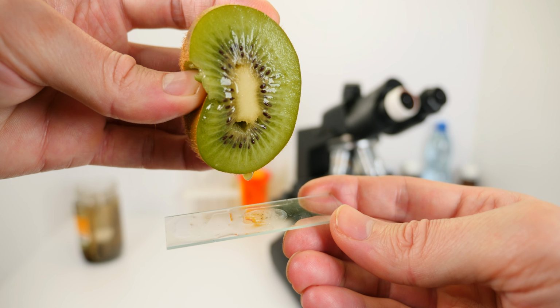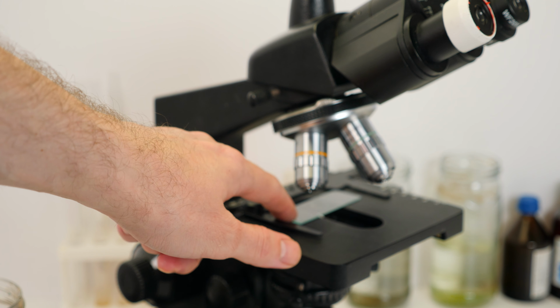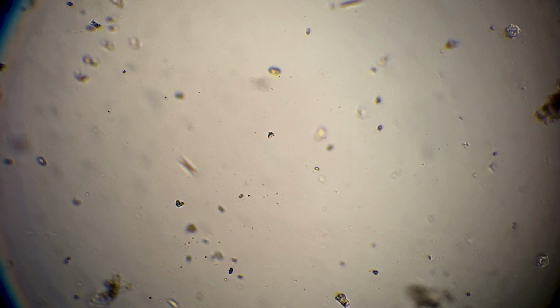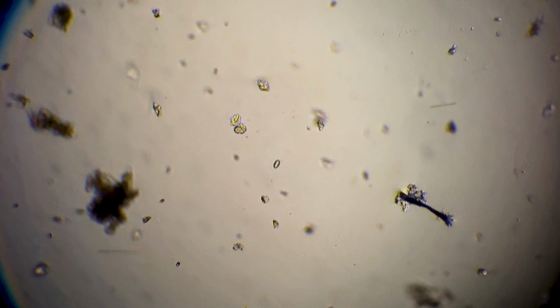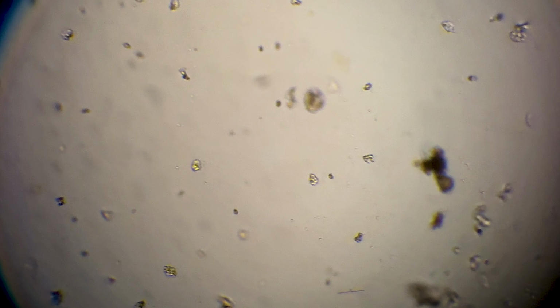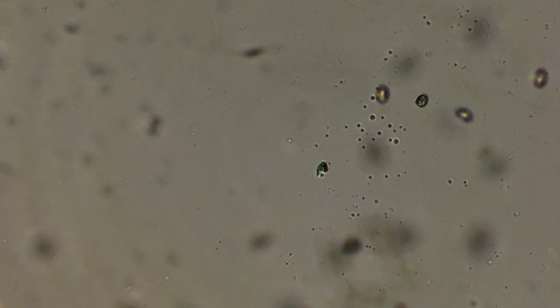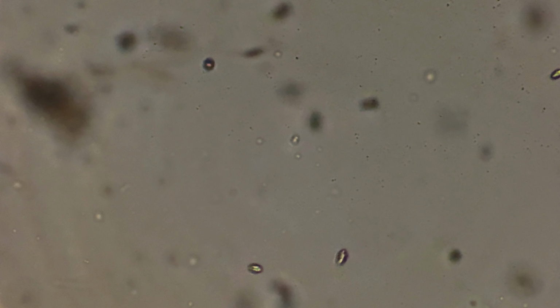What happens if I drip ordinary kiwi juice directly onto thousands of live bacteria from stagnant water? Let's take a look at their reaction under the microscope. Right now, under this lens, there could be over 1,000 tiny organisms swimming around, spinning, hunting, just living their tiny lives. And in a few seconds, their whole world is about to change.